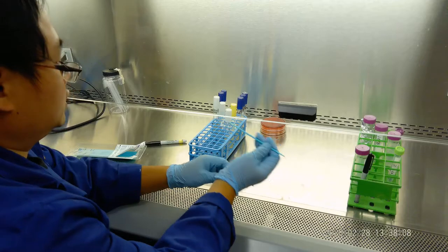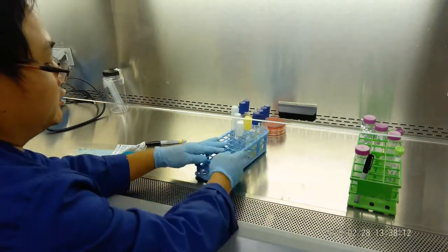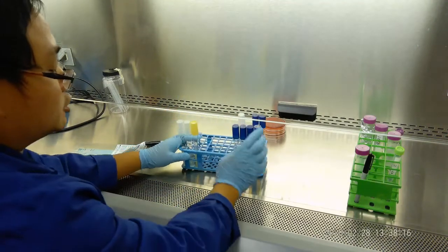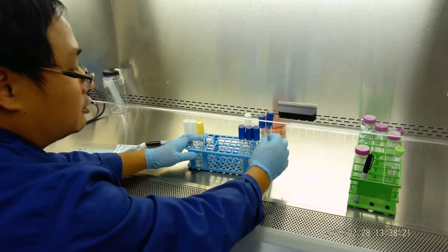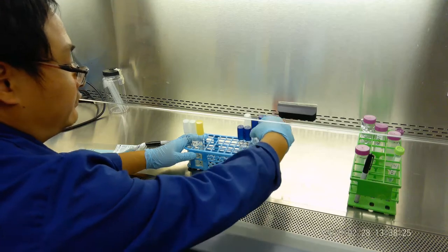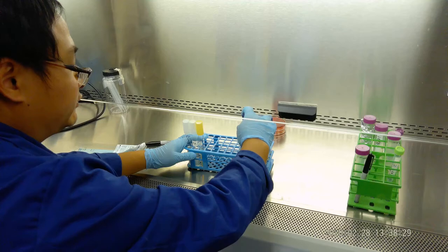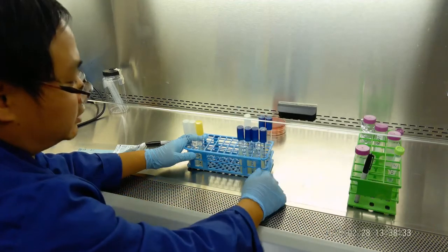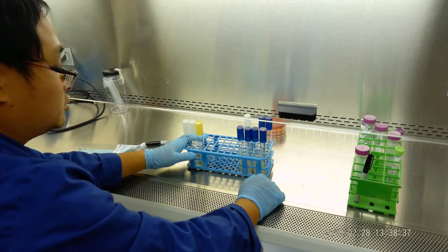Okay. So then all of these we will incubate at different temperatures. You give these to the TA, and each will be incubated individually at a different temperature: 4 degrees Celsius, 25 degrees Celsius, room temperature, 37 in the incubator, and 55 in a little bit warmer incubator. So we want to see whether the mild heat will kill E. coli. Okay, so that's all we're going to do. Thank you very much.